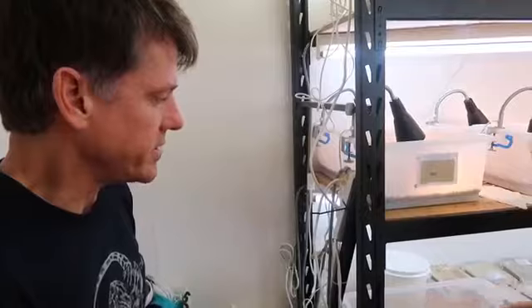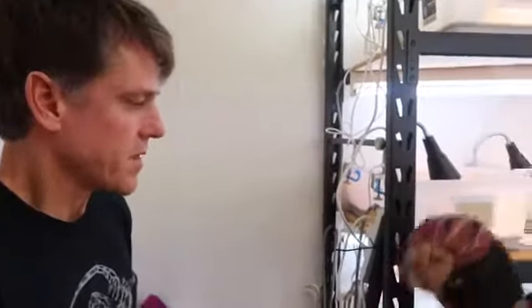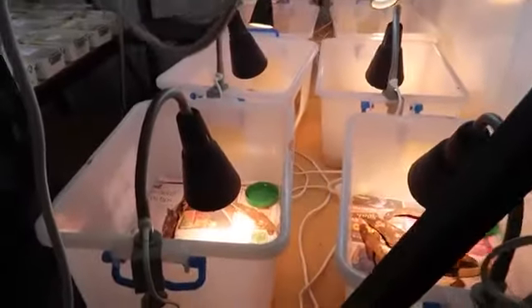So this is a project that Dan Noble is running along with Fonty Carr, one of his PhD students. They're interested in a whole bunch of questions about pace of life and life history, and whether the developmental environment of the egg and the offspring impacts all sorts of traits like growth rates and metabolic rate and learning ability and things like that. We've got the advantage of having this great facility, so we can raise lots of lizards under controlled conditions to answer these sorts of questions.